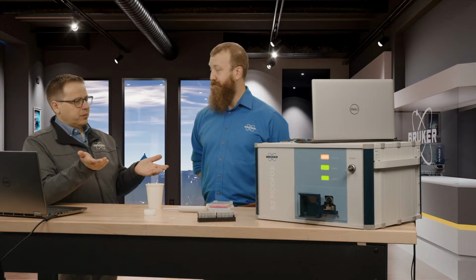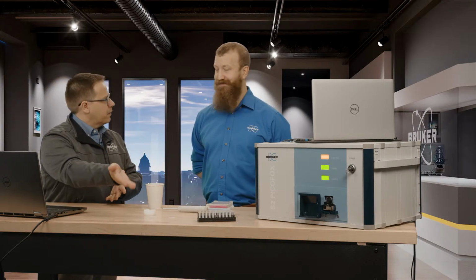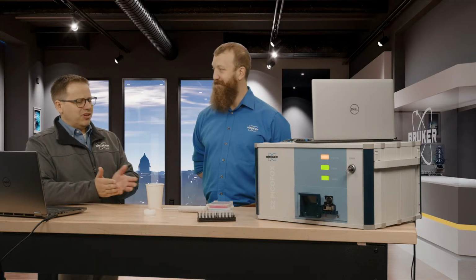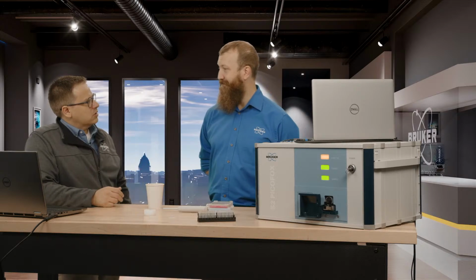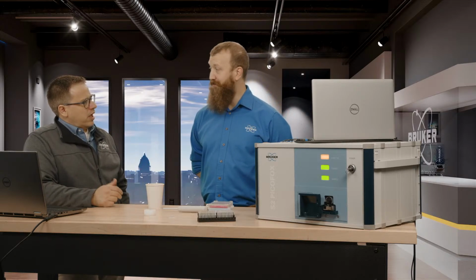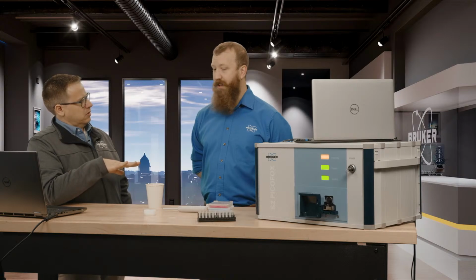So from that perspective, we're talking about low utility requirements. You just plug the thing in. You might occasionally have to buy some new sample holders, but once you buy this thing, you don't have any ongoing costs. Yeah, more or less. And I'm guessing this thing runs at a pretty low power, so you don't really have to replace the X-ray tube or anything. Nope.